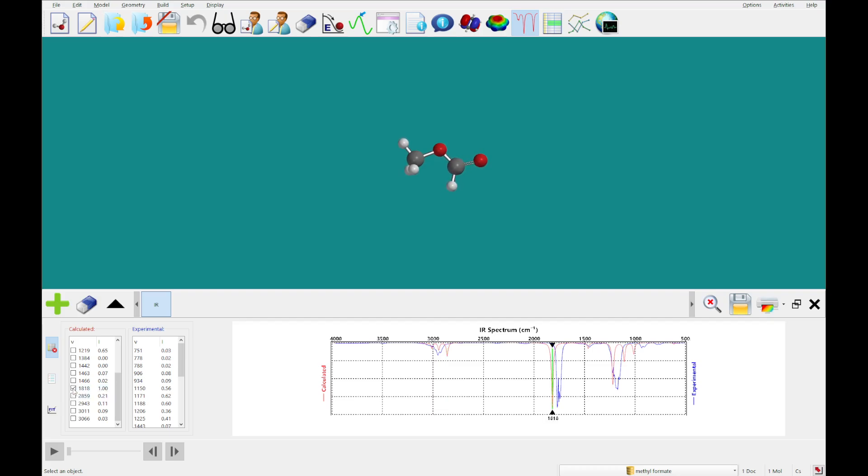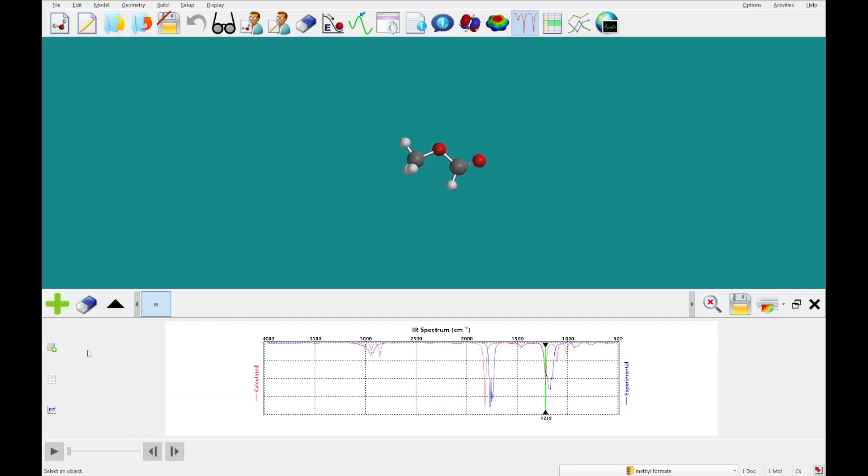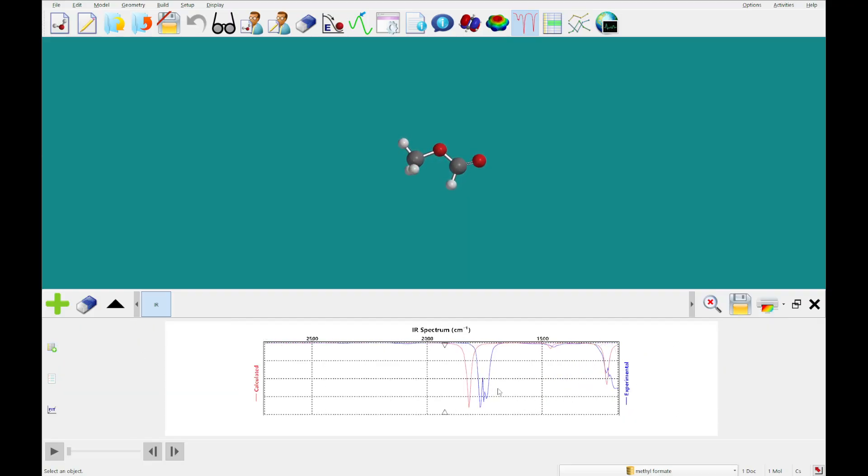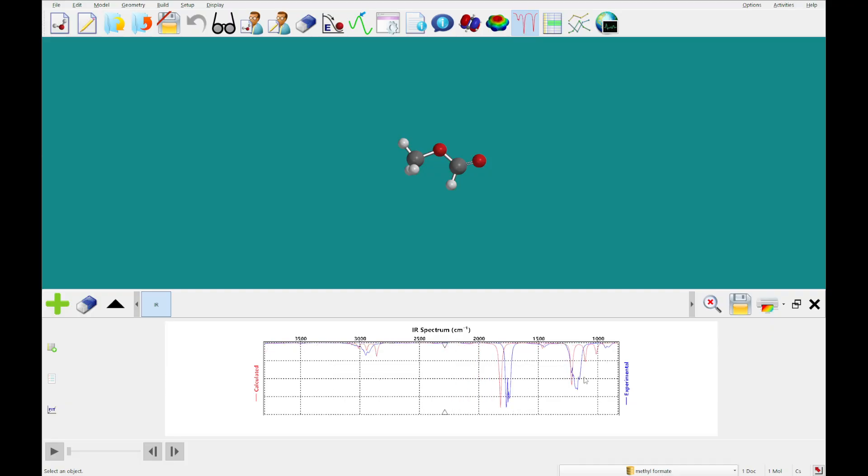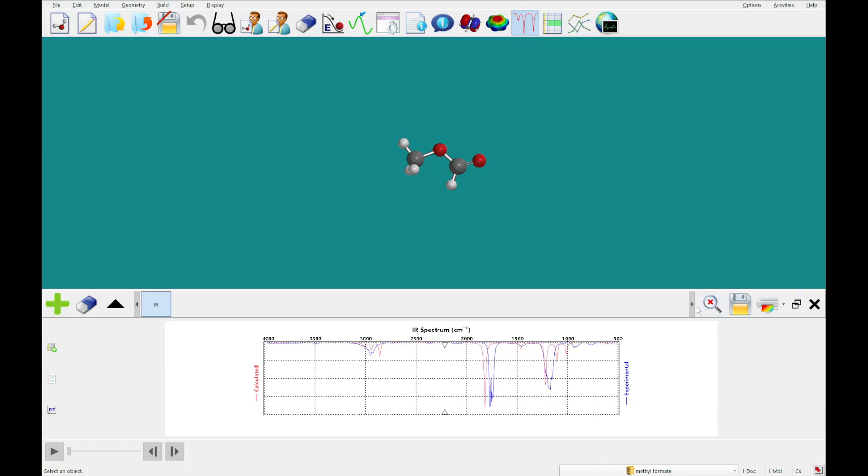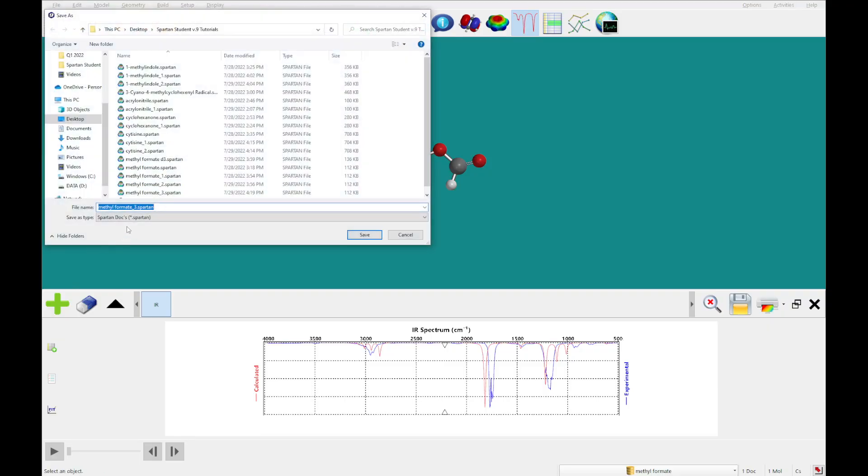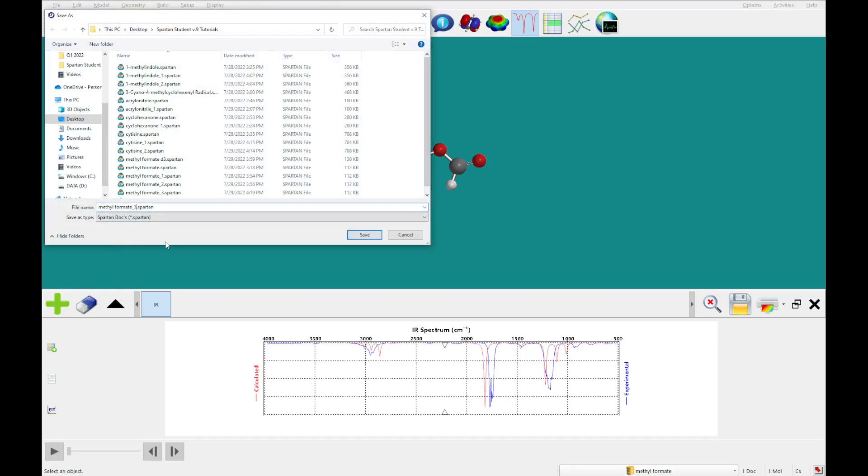There's our max, another large peak, and you can see that there's a pretty good correlation, but as usual, not a perfect match between the calculated and experimental data. So what I'm going to do now is actually save a copy of this file.